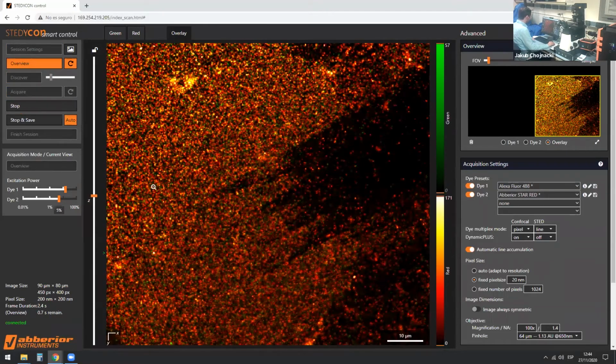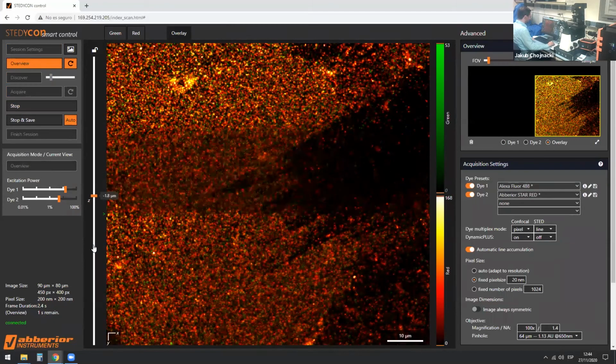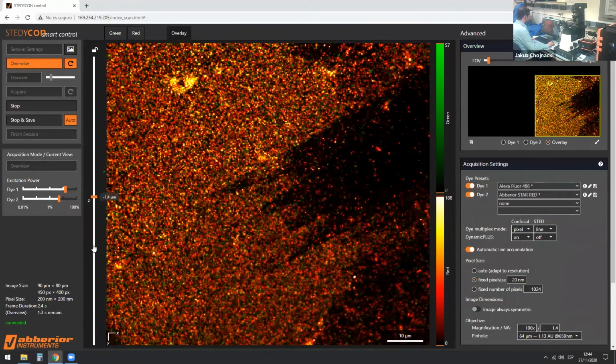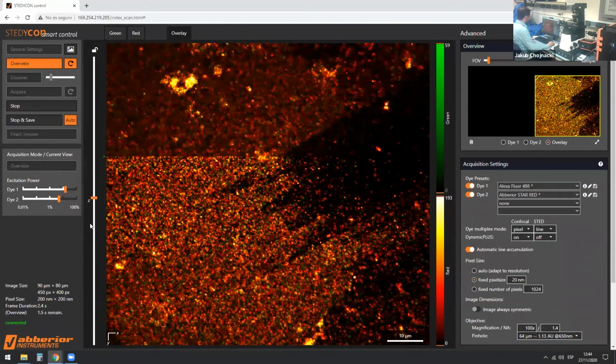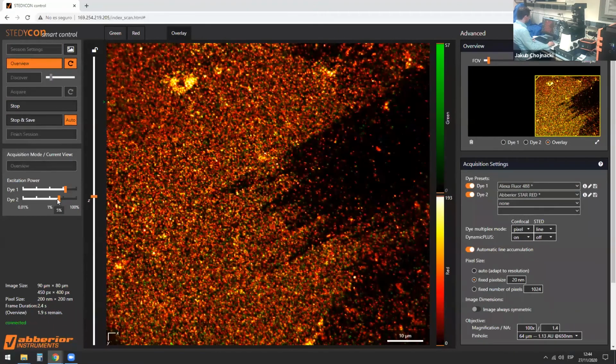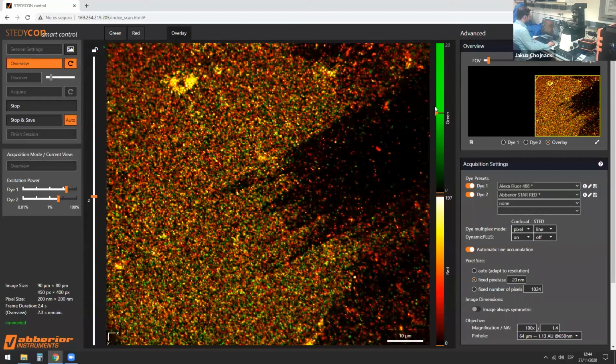So what we see here, actually, let me change the focus a little bit and try to explain. Those little dots are viruses, and as you can see, there is a lot of them. The green signal is a little bit less visible, so let me make it better visible. Okay. You can see a bit of an overlap between green and red signal. So these are the virus particles, and they also have a lot of red signal, which is those surface proteins on the surface.